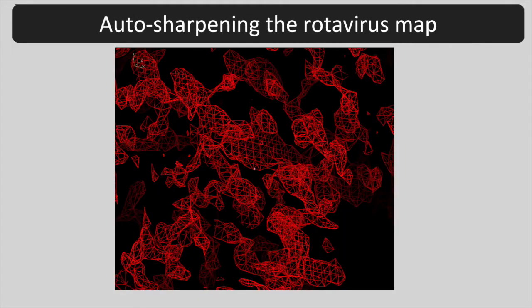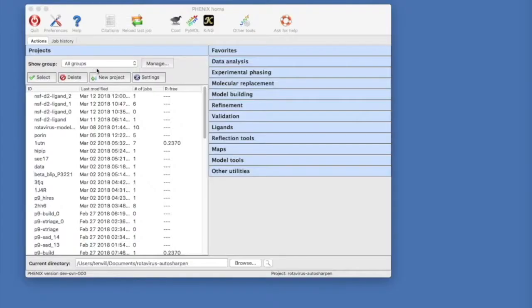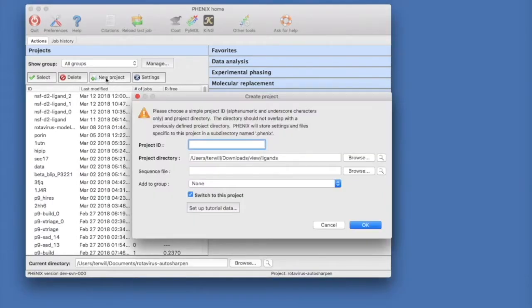Here is the over sharpened rotavirus map that we would like to auto sharpen. Let's open the Phoenix GUI and optimize the sharpening of this map. In the main Phoenix GUI, click New Project and then Set Up Tutorial Data.